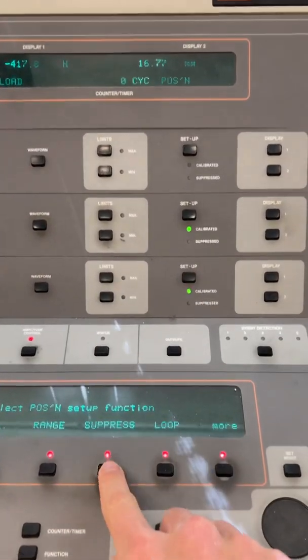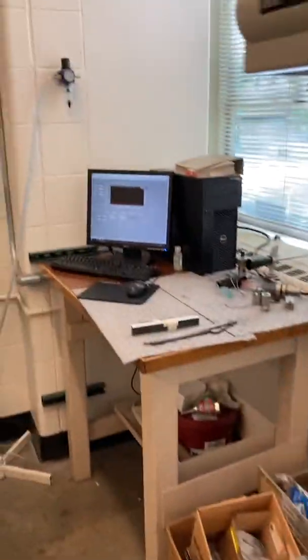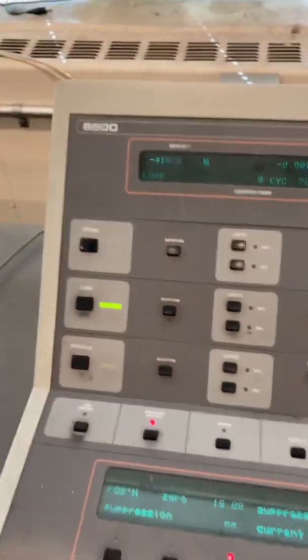What we can do now is zero out our position. Go to Setup, Suppress Current — so now our zero point is at the mean load. You can see the interface over there starts to change, which is good.